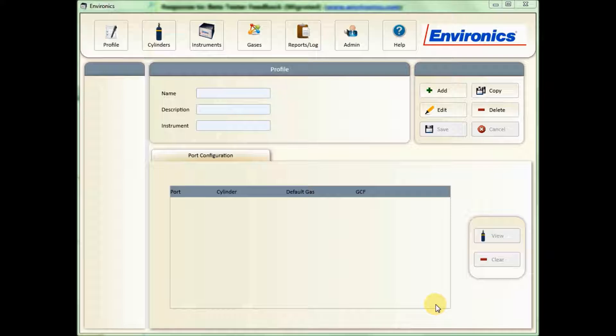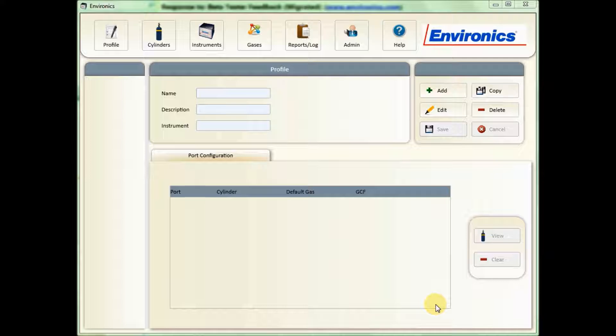Today we're going to look at how to create a profile in the new Environics Windows 7, 8, 10 software for the Series 4000.